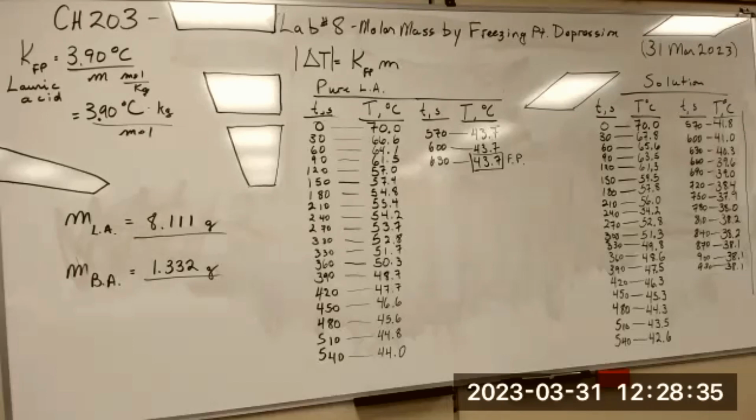Should I clean it off or anything? At the very least. See, the lauric acid and benzoic acid are not water soluble, so the stream should not come on. It's almost there.